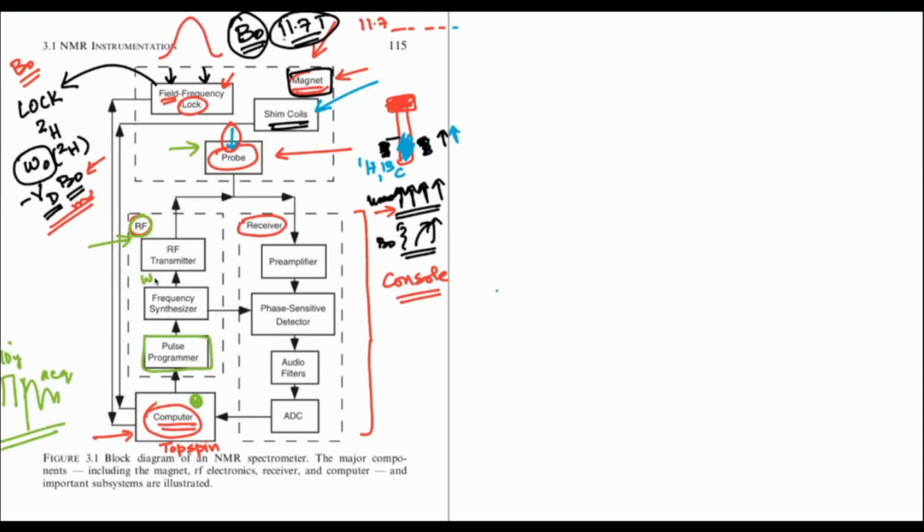And you start applying the omega RF in this place actually. Remember, we had this cos of omega RF t plus phi. Of course, the phi we just set as the Y phase. And of course, there's also a B1 that you have up front. So yeah, you have a B1 up front. The B1 is what is deciding whether it's a 90-degree pulse or whatever flip angle it is. Well, the omega RF gets added by this frequency synthesizer. We'll see why it is coming back later on in the receiver in a little while.